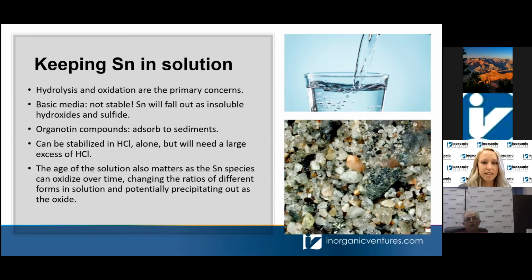So again, the age of your tin solutions does matter, as the ratio of tin will change over time if you're just stabilizing in hydrochloric acid alone, and if that tin is not fixed in solution somehow.